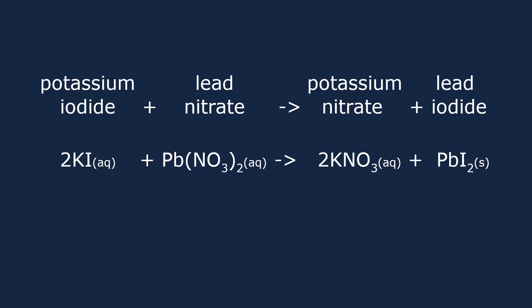As all nitrates are soluble, and all sodium and potassium salts are soluble, we can mix together solutions of potassium iodide and lead nitrate. This creates potassium nitrate and lead iodide. Lead iodide is insoluble, and so precipitation occurs, forming the yellow solid.